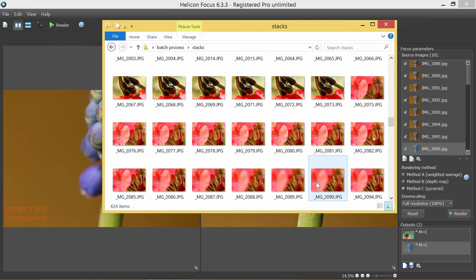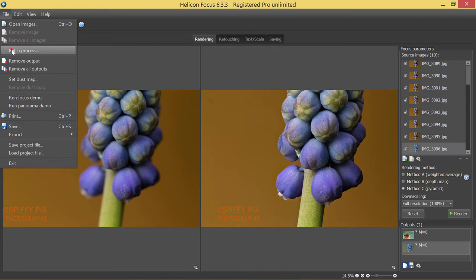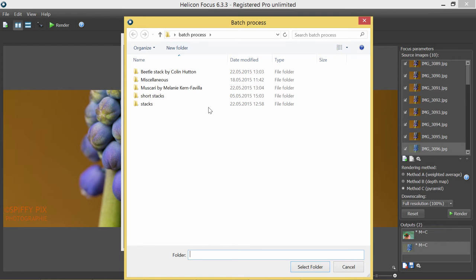Now let's go back to our batch process dialog and have a look at a smart solution. I add the whole folder with all of the images I've got, and I press the little gear icon to call the menu and choose the split stack option.